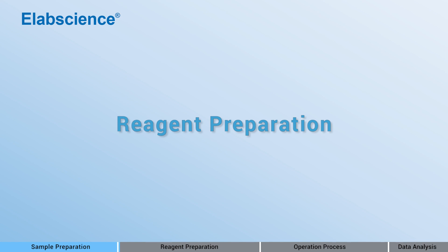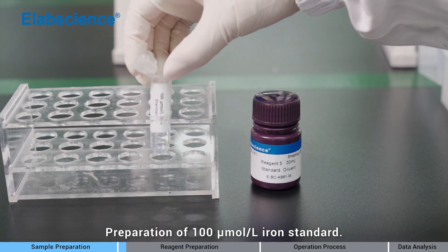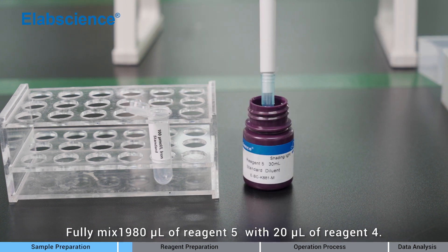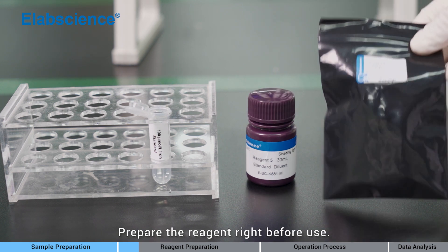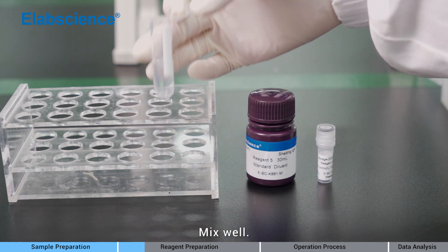Reagent preparation: Preparation of 100 micromolar per liter iron standard. Fully mix 1980 microliters of reagent 5 with 20 microliters of reagent 4. Prepare the reagent right before use. Mix well.